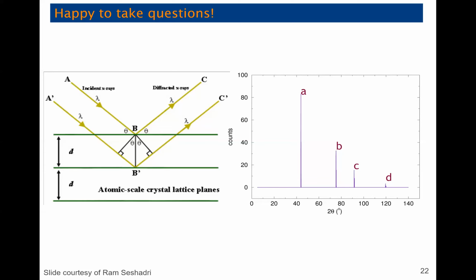so that we can still see what's in there without exposing samples. One of the ways that we used to do it was with Kapton film, which is the same thing that those synchrotron sample tubes are made out of. But on the laboratory scale, we see a larger amorphous background from that. So if you don't have a really crystalline material to begin with, the peaks might not show up above the background. So we're looking for other options.